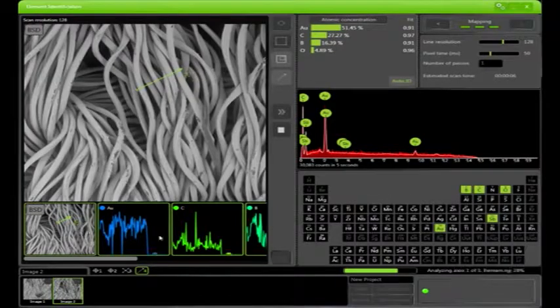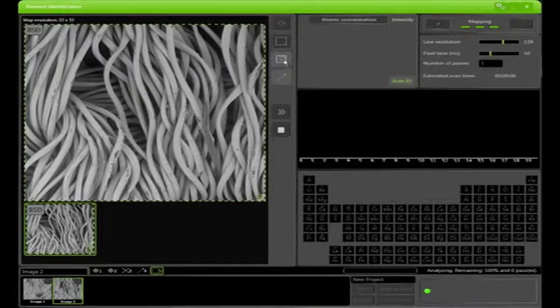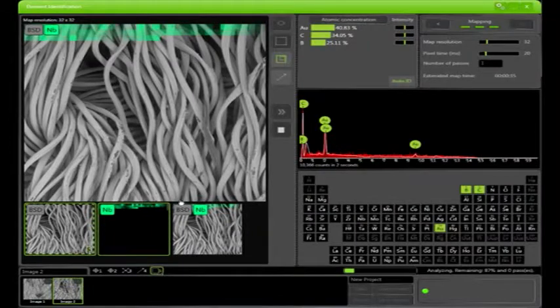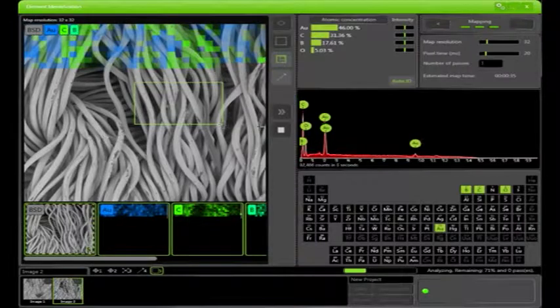Let's go back to our image. There are some screens here which indicate that, and then you can also do an elemental mapping. That was another full image mapping that I just selected. This is a really unrefined mapping, but it's all right, it'll work. Then you can also do a specific region, which you indicate by clicking that second button, highlighting a region, and getting that mapped.